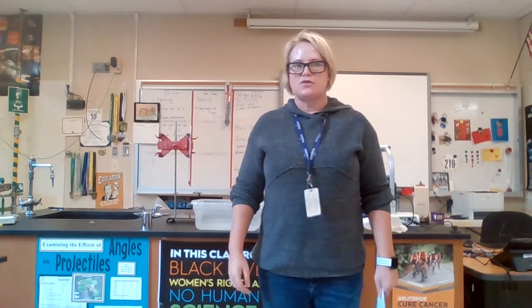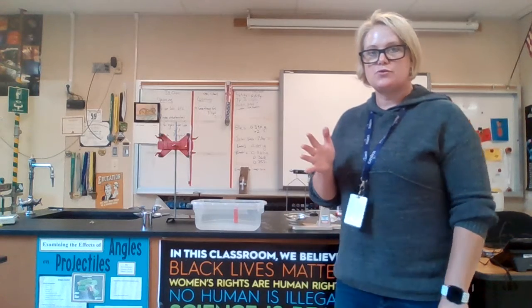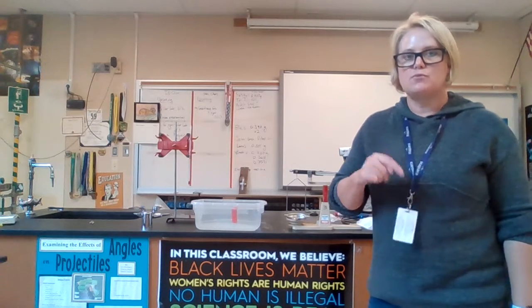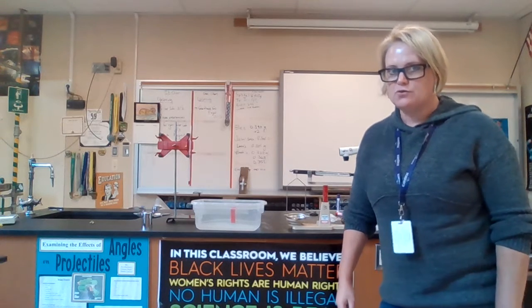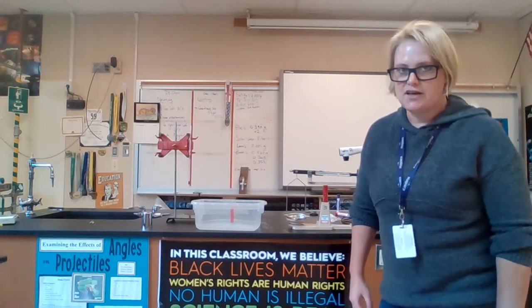Folks, here we are in Miss J's chemistry classroom again. We're going to talk through one of the IB mandatory practicals, which is how to find the molar mass of butane gas. This is one of the required practicals that all IB students do worldwide. So this fits perfectly into gas laws.